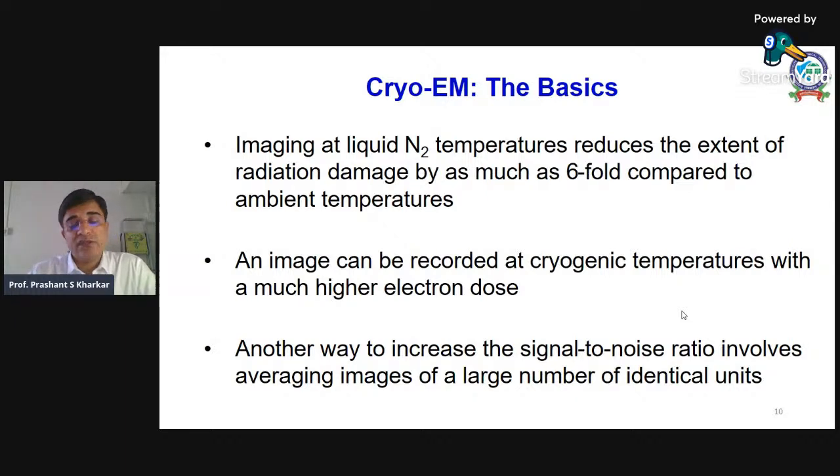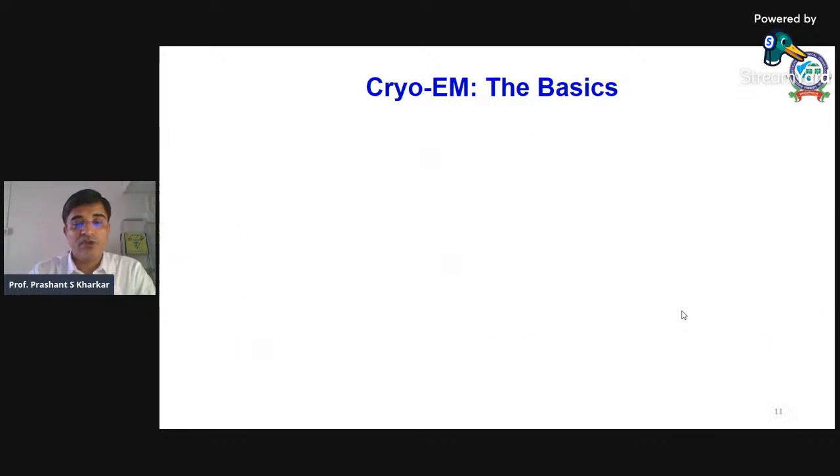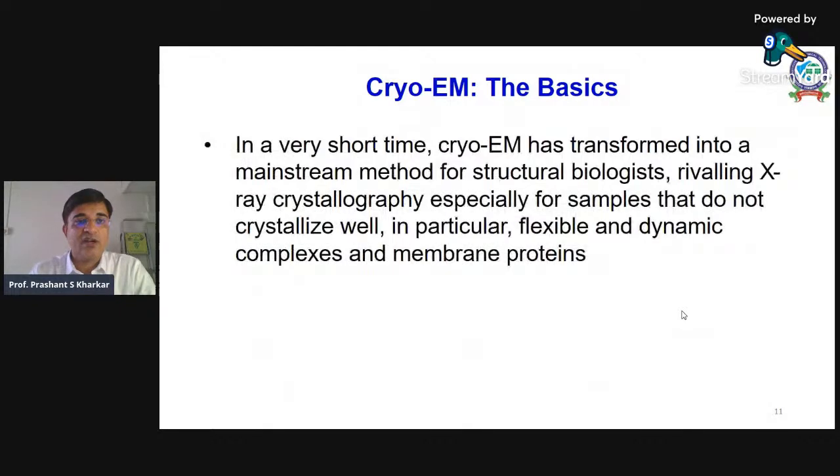And believe me, for a drug discovery scientist like me, having the three-dimensional structure of a molecule at 1.2 angstrom resolution is like a dream. People have achieved atomic resolution with X-ray crystallography, but with cryo-EM somebody has achieved this kind of resolution, which is amazing, and that's exactly why this technique is going to surpass it. It has already surpassed the speed and quality of X-ray structures, particularly for assemblies which are not possible with X-ray crystallography.